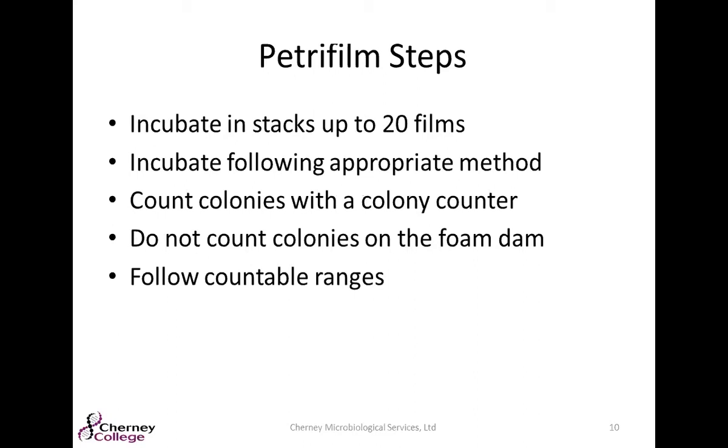3M recommends that you incubate in stacks up to 20 films. Make sure that you incubate following your appropriate method. It's recommended that you count the colonies on the Petrifilm with a colony counter, and do not count colonies on that white area, the foam dam around the plating surface. Make sure you only count colonies within that surface.